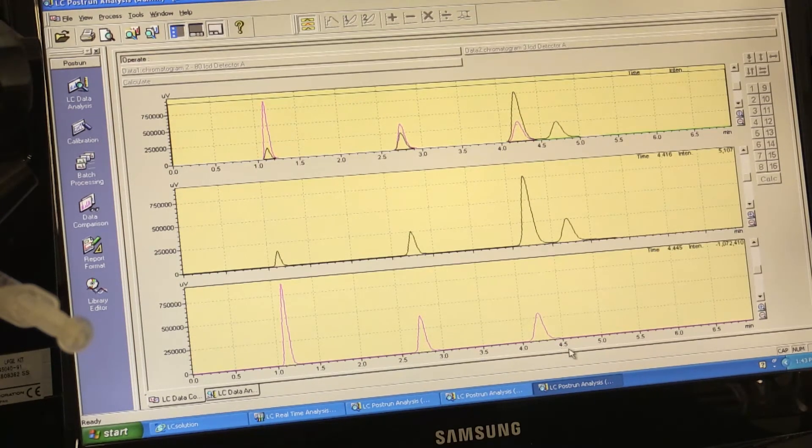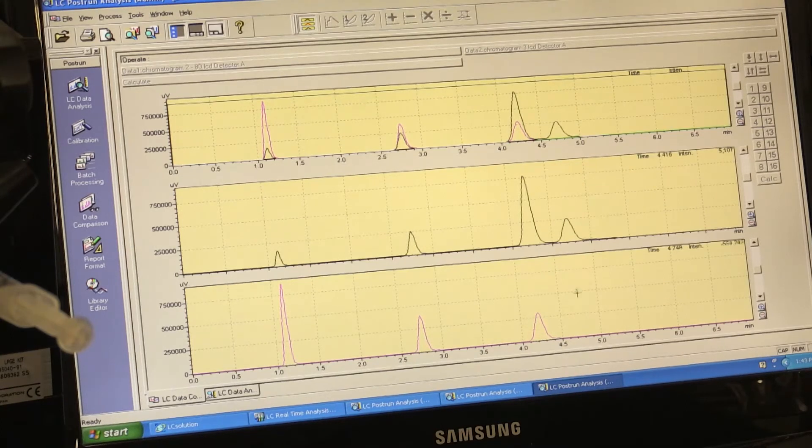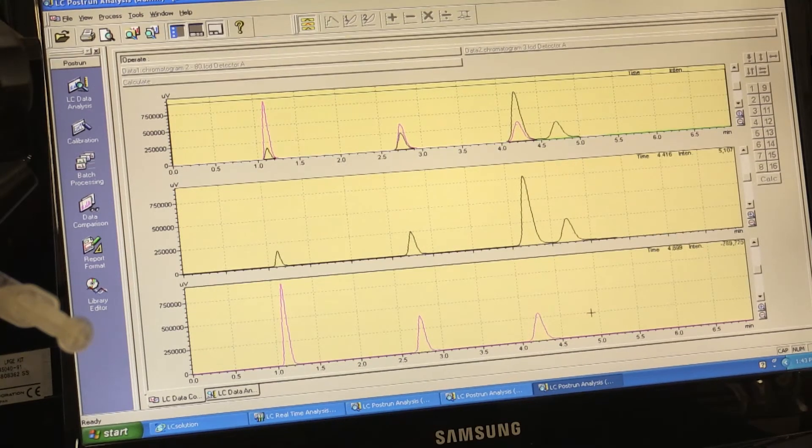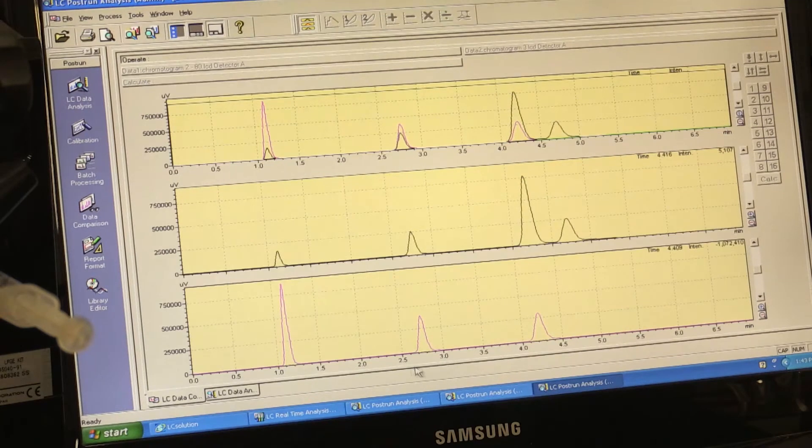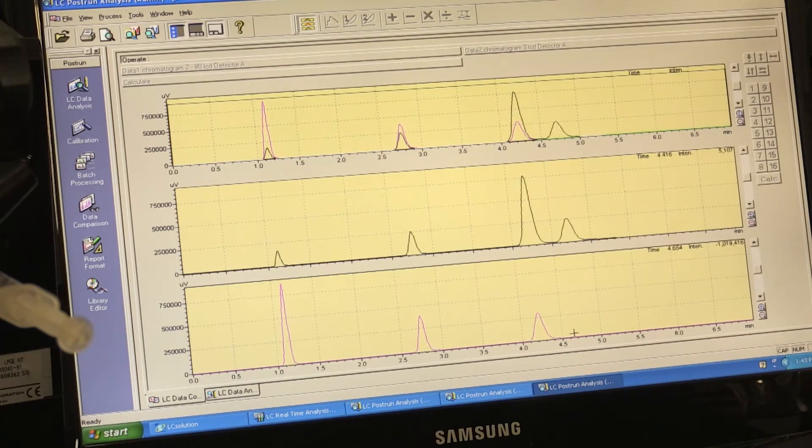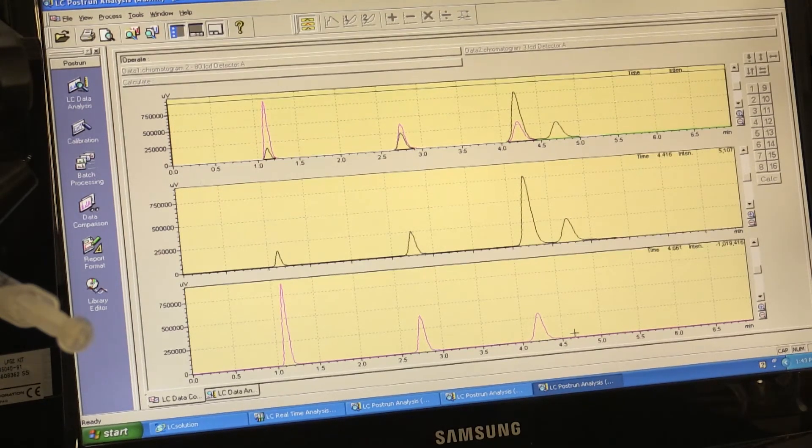it is peak number 4 that does not absorb at 280 nanometers. The other peaks as well have been affected by the change to 280.